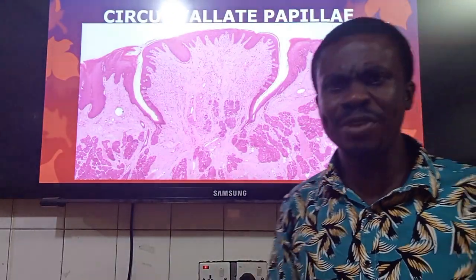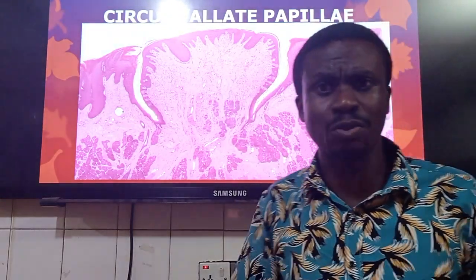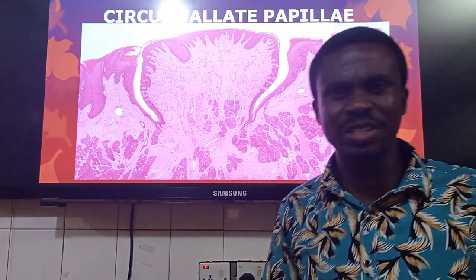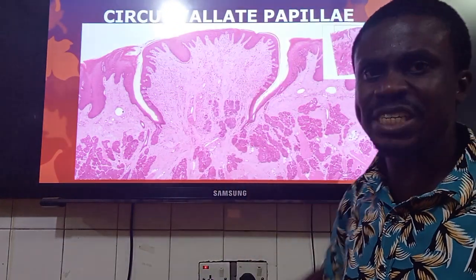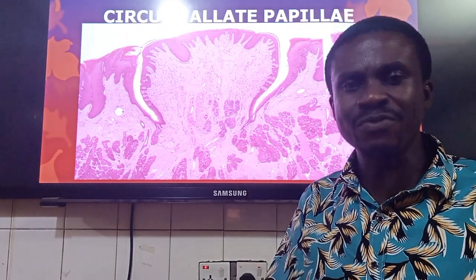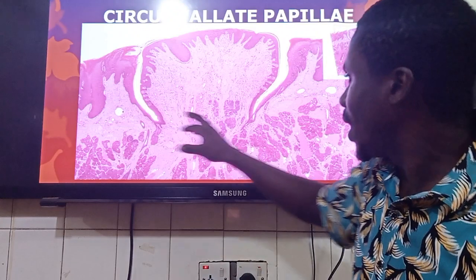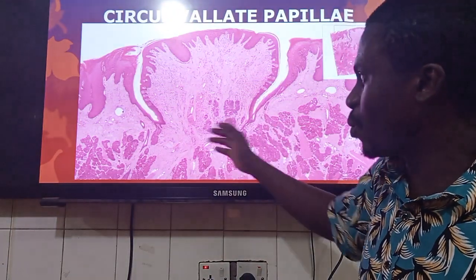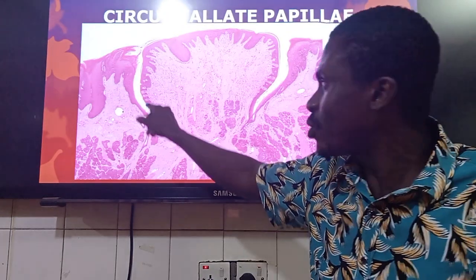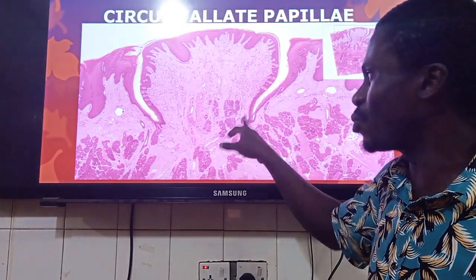Yes, sometimes some students tell me that you can see gustatory pits, or otherwise called moats, otherwise called trenches, otherwise called furrows. These things will always be there, whichever papilla is present, as far as it is relevant in gustation, because we are well endowed with taste buds. At the base especially, we are going to have these serous secretory glands bringing their secretions so that they can wash off already tasted chemicals so that new ones can be tasted. So these ones will always be there.